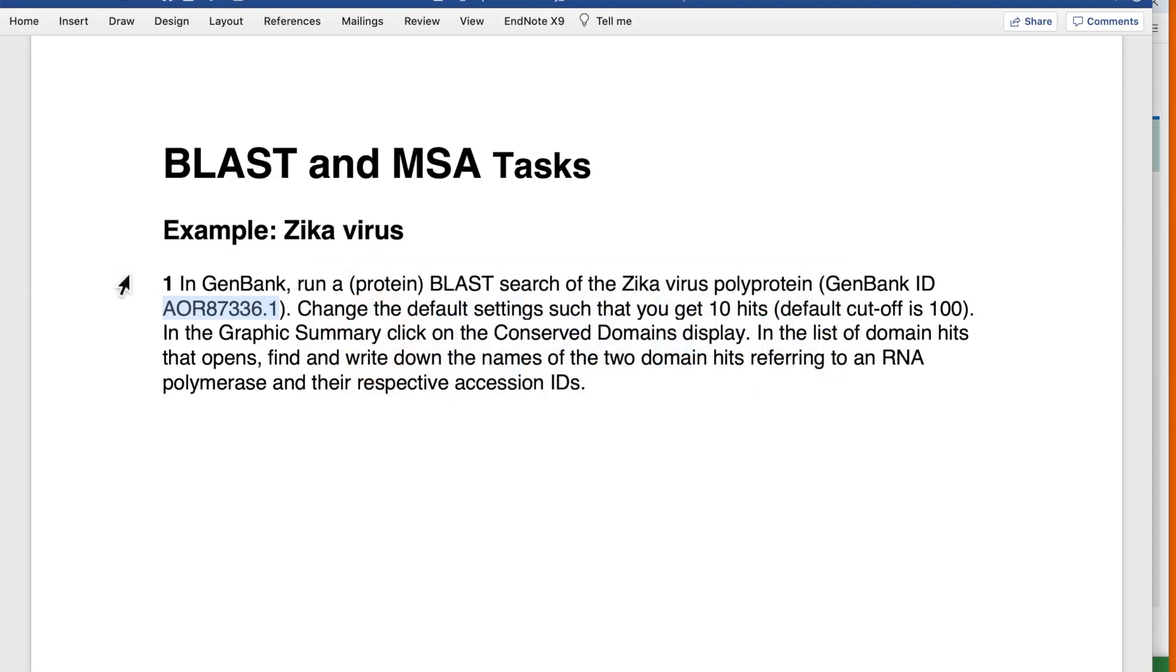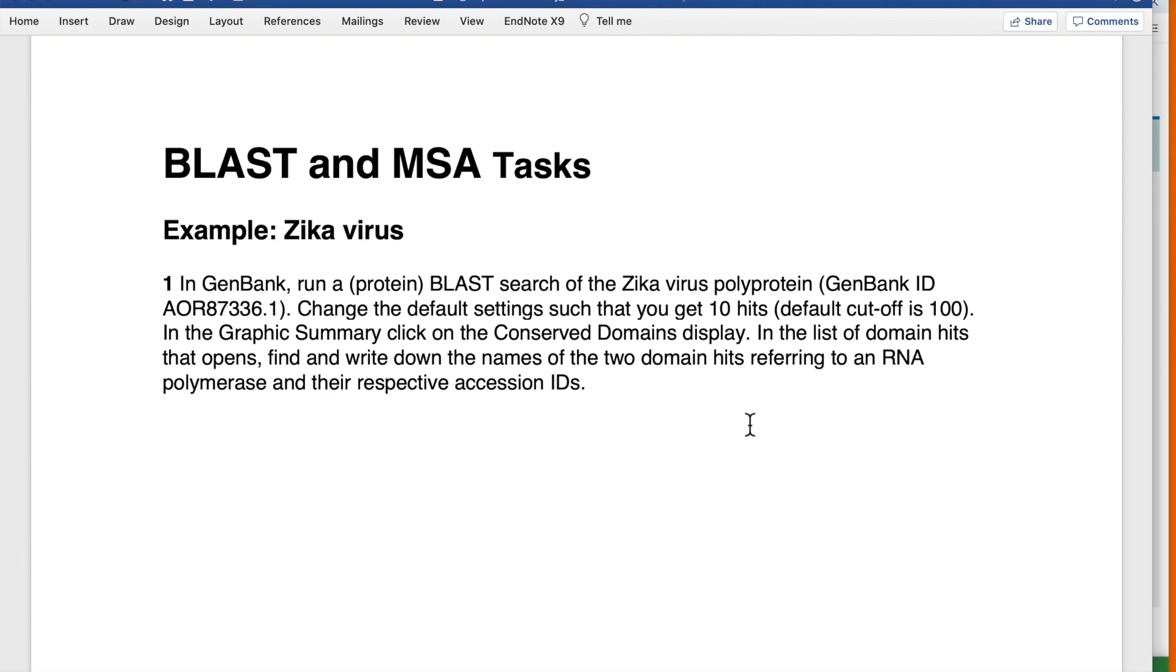Now look at the instructions of what we are supposed to do with the results. In the graphic summary, click on the conserved domains display. In the list of domain hits, find and write down the names of two domains that refer to RNA polymerase and their respective accession IDs.